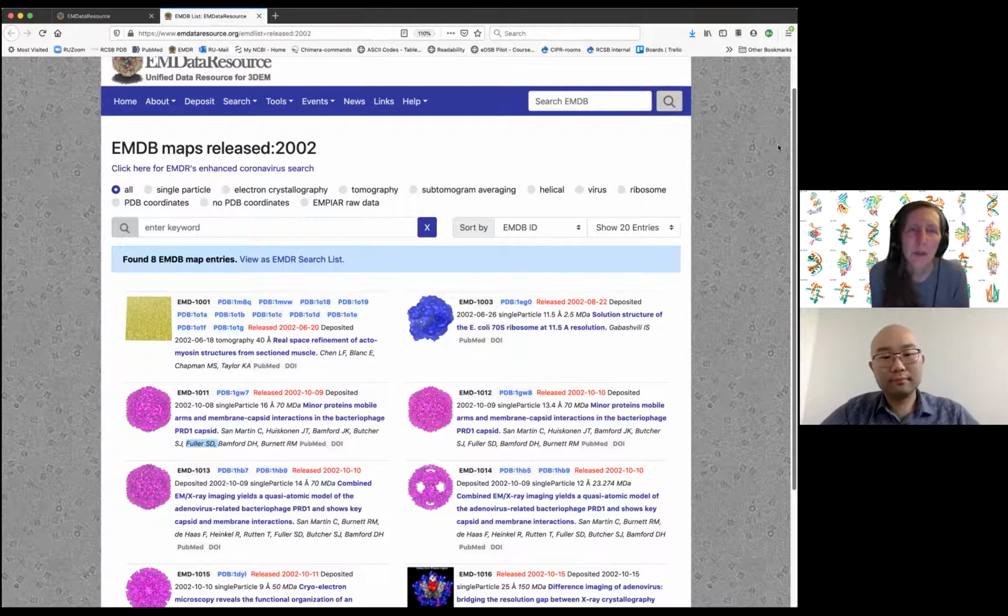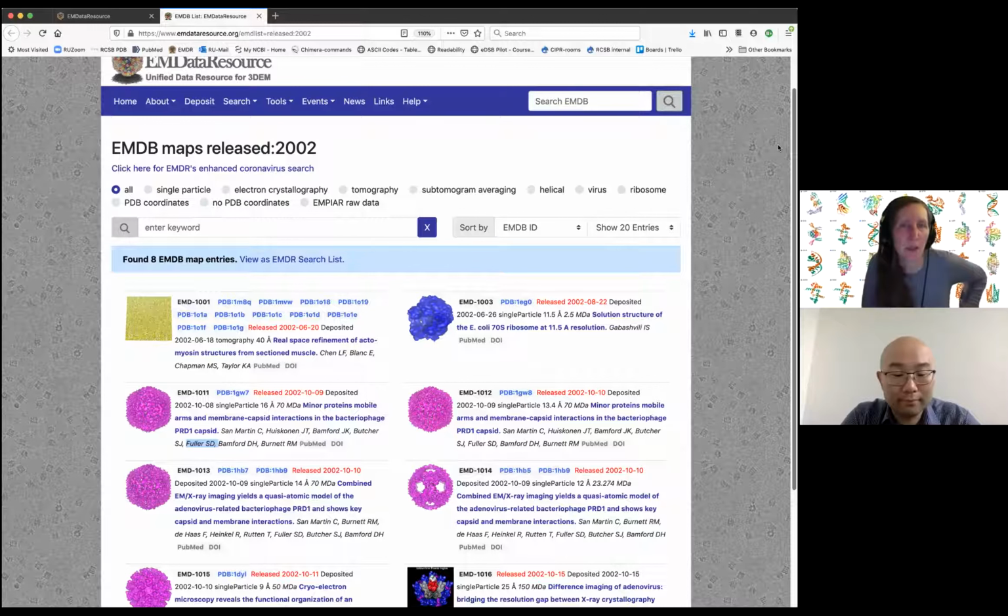The first thing that happened was to create a dictionary of data terms. So, for a microscope, what are the parameters that you would use to collect your data? What was the voltage? All these various kinds of things.